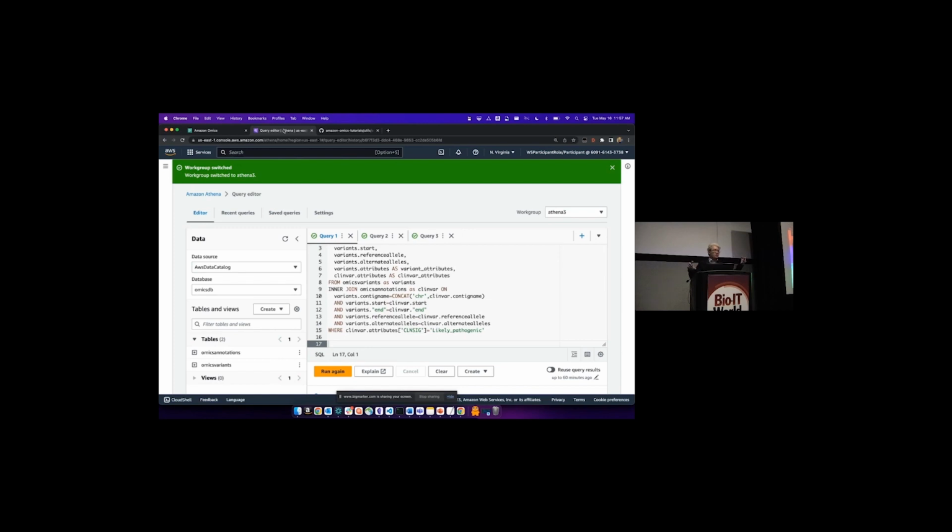If you want to compare two samples in the same variant store, you would do two sub-selects, sample 1 and sample 2, and combine them later in the SQL query. Or you can have them come from two different variant stores. It really depends on how you want to arrange your data and what query works best for the question you want to answer. That's why I was saying before, at that point it becomes a data science question.